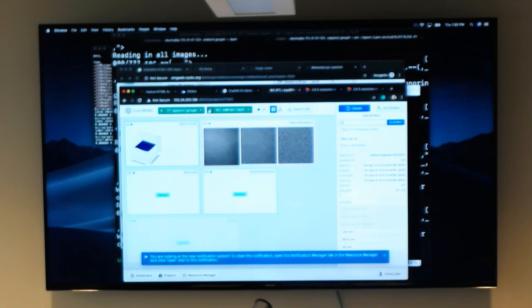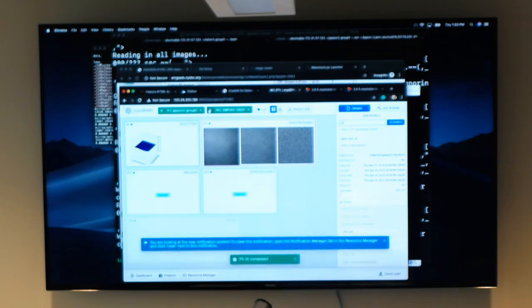And this is pretty much a different iteration. Is it? No, it's the same. It's another way of displaying it, I guess. It's like an opposite. You have to have the space precision also. Another measure of that, another way of thinking about that, I guess. Otherwise, it won't be able to identify the direction so particle precision is high. The numerical statistics are probably better.